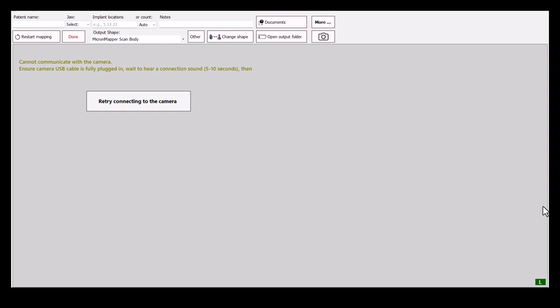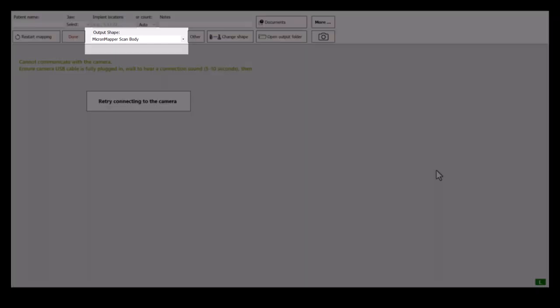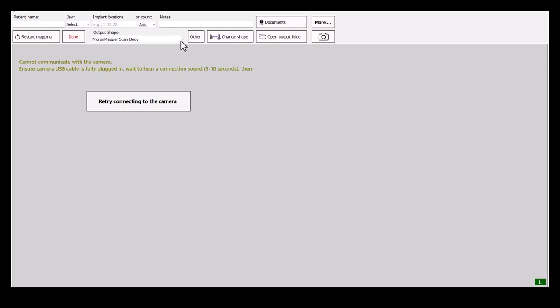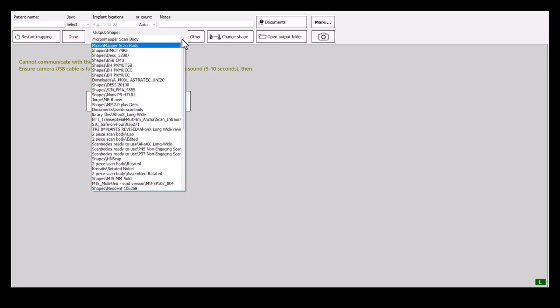To begin, we need to pre-select the desired shape of the output, which can be done from the drop-down menu.